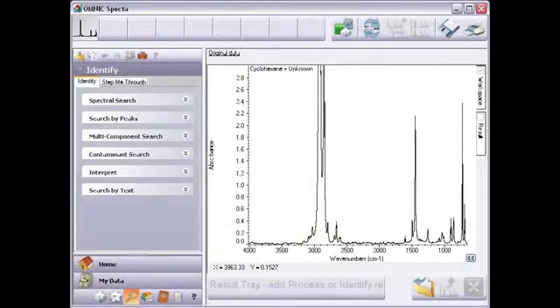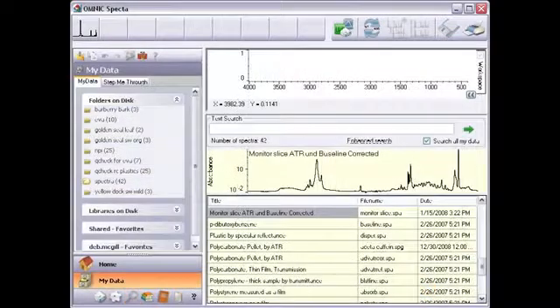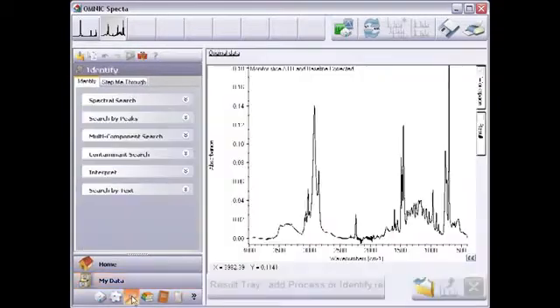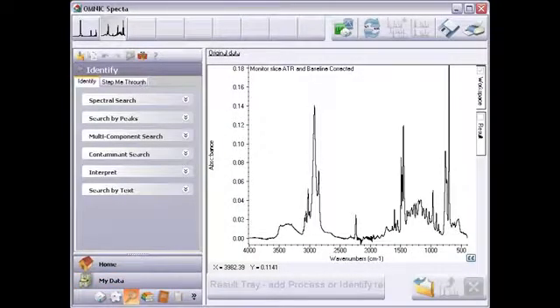I'll show you an example. This spectrum is from the case of a computer monitor. Housings for electrical devices must meet strict specifications so the formulation is carefully scrutinized and documented.